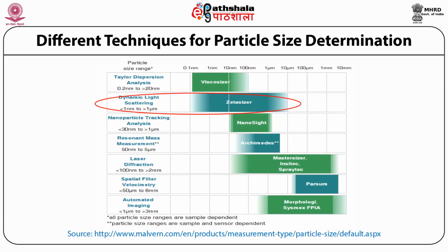For the determination of particle size, there are different techniques. We can have Taylor dispersion analysis, dynamic light scattering, nanoparticle tracking analysis, resonance mass measurement, laser diffraction, spatial filter velocimetry, automated imaging. Among these techniques, the only technique available with us is the Zetasizer, which will give us a particle size ranging from 0.1 nanometer to 10 micrometer, and that is why this technique is utilized in determining the particle size of a microemulsion.